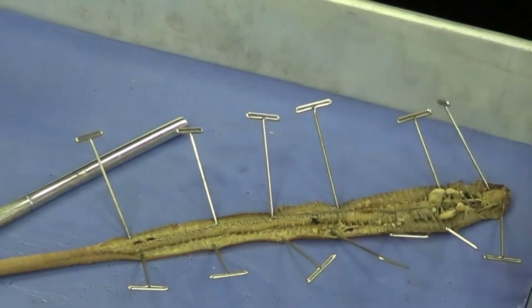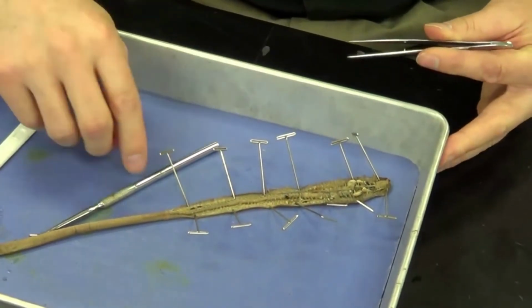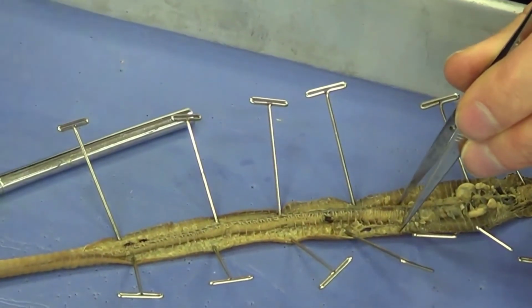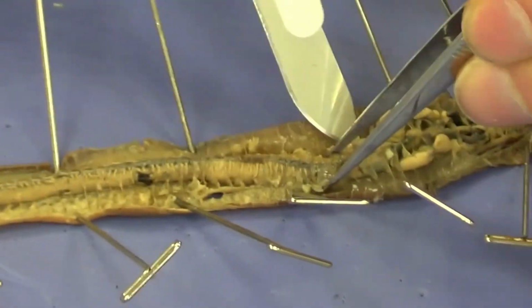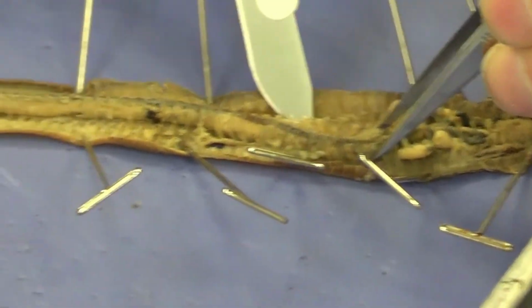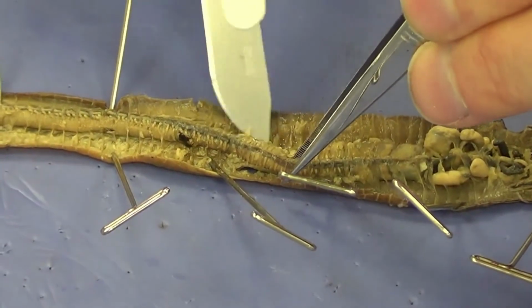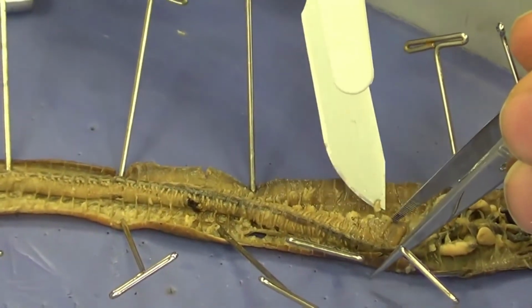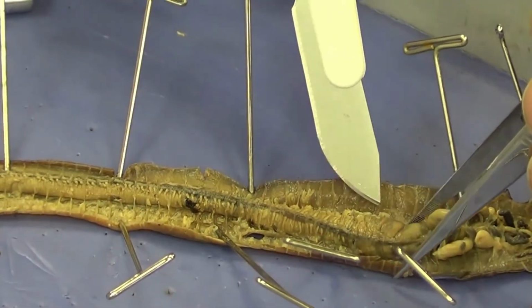Now, the last thing we need to do is we need to roll this intestinal tract, this digestive tract, out of the way a little bit. I don't just want to cut it up, but I want to roll it out of the way. So I'm going to take my forceps and kind of pull it over just a little bit. And I'm going to cut some of the septa that are holding it in place. Again, keep doing that very gently. And I want to do this towards the anterior of the worm because this is where my largest structures are going to be. And what I'm looking for here is I'm looking for the nerve cord.